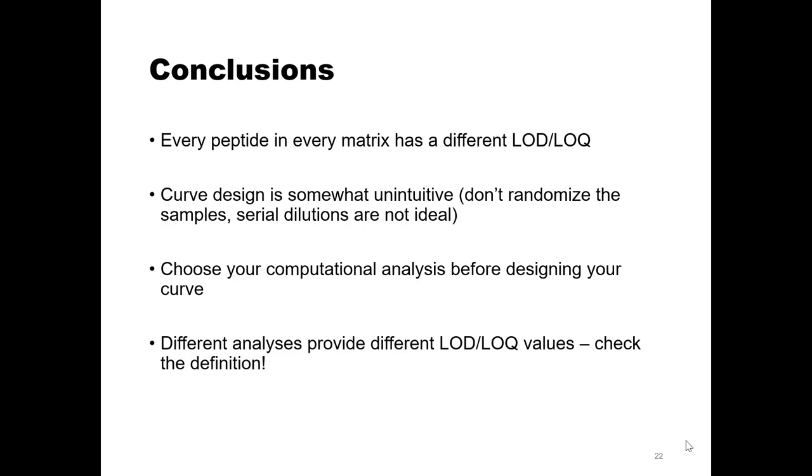We're using the word calibration curve. How you use the word calibration curve is really different than the LOQ. And I'll just build up what the guidance is here. The FDA is putting together their guidance document. They're going to define the LOQ as the lowest concentration within 20%. You know, that linear solution to that point, you recover the concentration. That's the definition of linearity. So linear and precise, that's what they want.